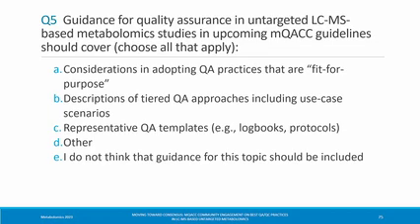Yes, Jennifer. So I take a very pragmatic approach here, that first of all, what do we mean by fit for purpose? You could take a lab that does absolutely none of these things, doesn't check their data, and publishes results, but they're meaningless, but nobody knows that they're meaningless. I would argue that's not fit for purpose. So we should agree that everybody needs to be doing some form of QA at some point.